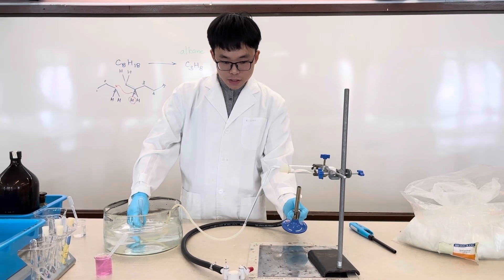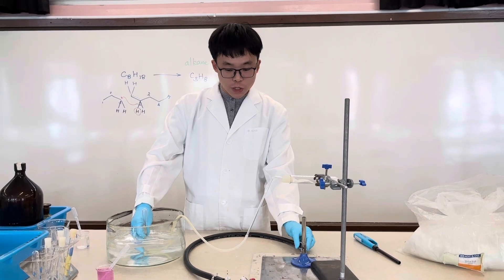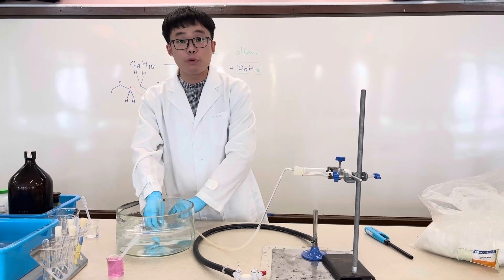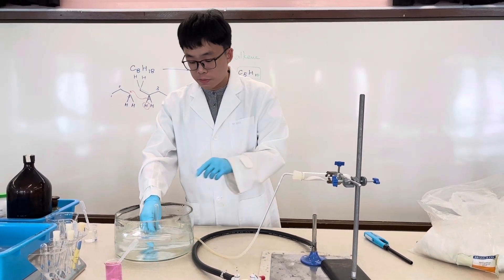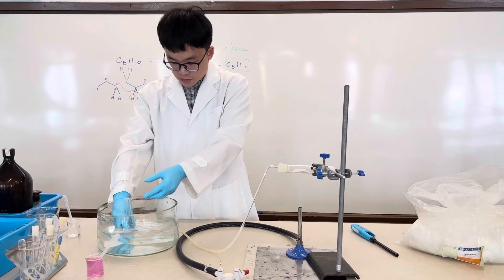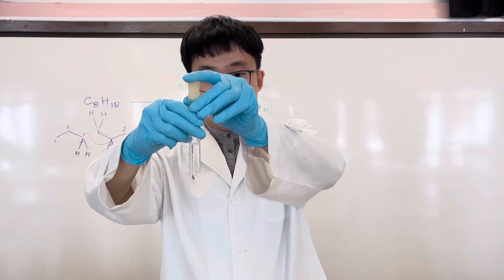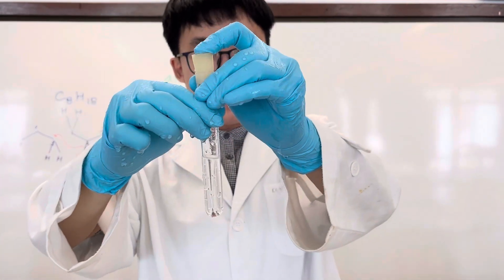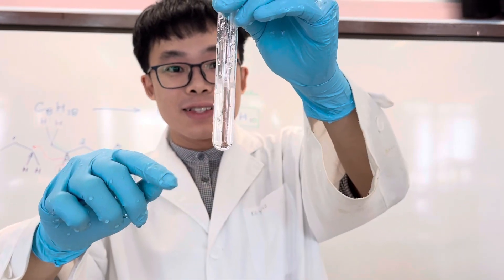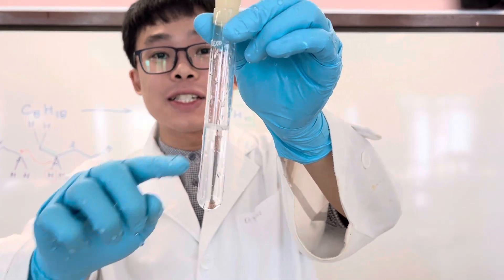There is one important precaution for this experiment: before we switch off the flame, we need to remove the delivery tube first in order to prevent suck-back of water, which might crack the hot test tube. When I tilt this tube a little, you can see we have forced some medicinal paraffin through — there is actually an oil layer on top of the water. Is that our desired product? And now we can switch off the flame.